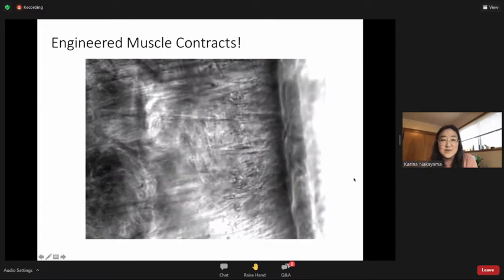And so we are pulsing this to contract. It's in a suspension of a buffer, and we're just pulsing it with a very, very mild electrical stimulation, and it's going to contract on its own because we engineered it to do that. Now, we were engineering other kinds of muscles with different materials, and this was by far the best contraction.